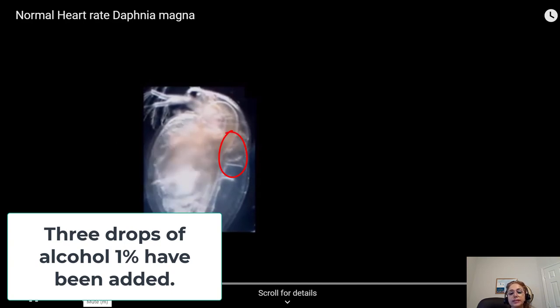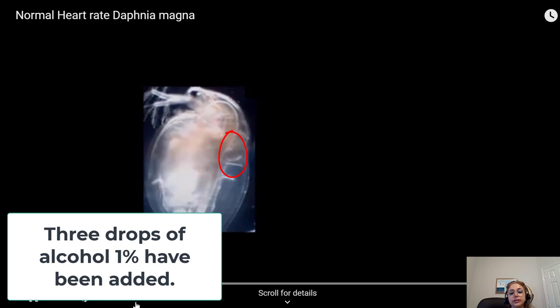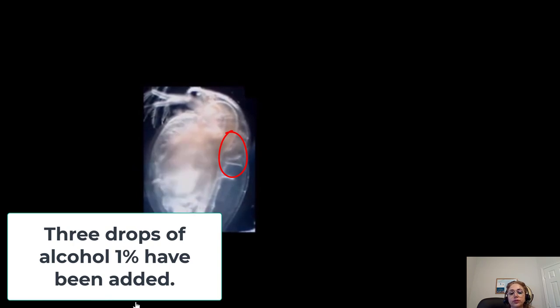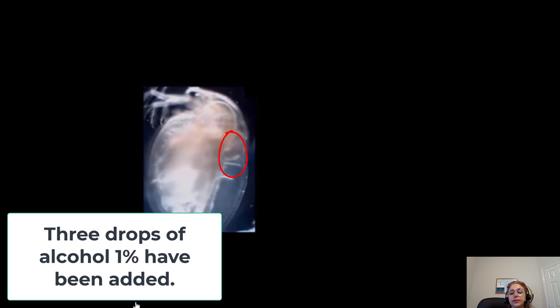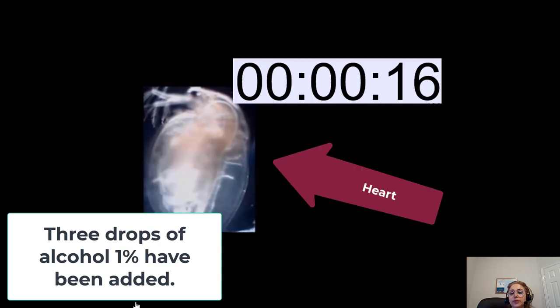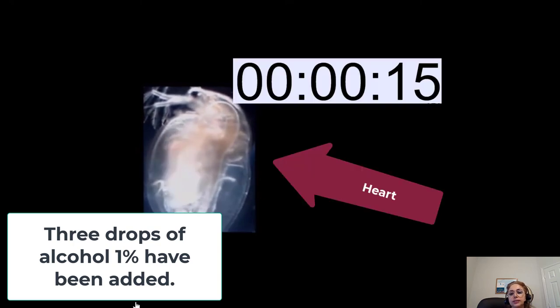3 drops of alcohol 1% have been added to Daphnia. You need to start counting the heartbeat when you see the timer on the screen.